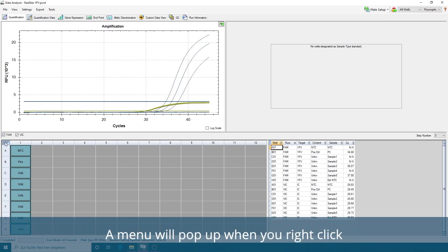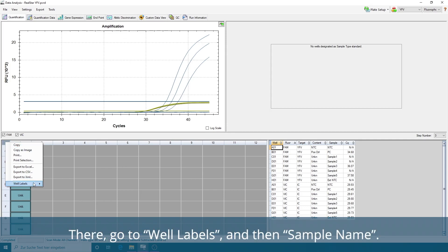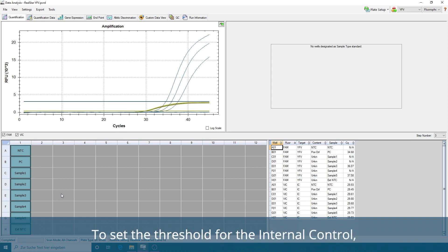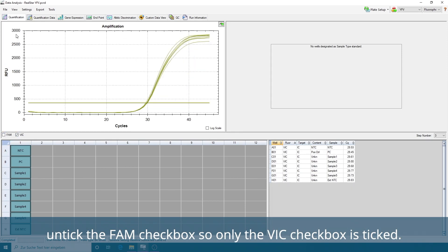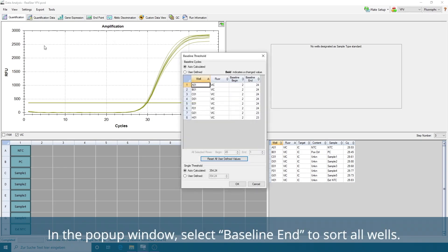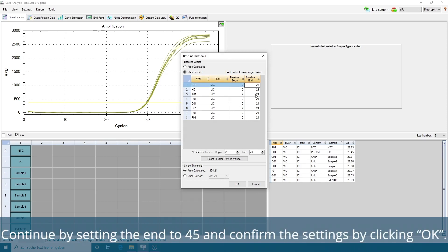A menu will pop up when you right-click on the marked upper-left corner of the PCR plate field. There, go to Well Label and then Sample Names. This will display the individual sample names in each well. To set the threshold for the internal control, untick the FAM checkbox so only the VIC checkbox is ticked. Then go to Settings and select Baseline Threshold. In the pop-up window, select Baseline End to sort all wells. Highlight the wells with a Baseline End smaller than 10, if there are any. Continue by setting the end to 45 and confirm the settings by clicking OK.